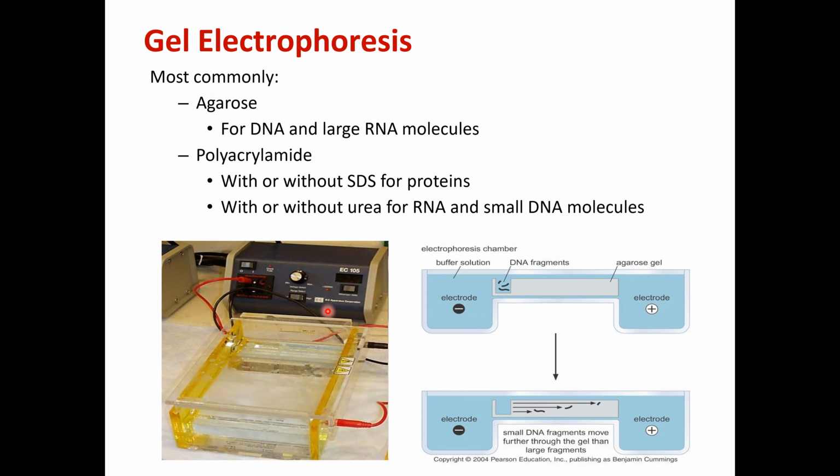This is a typical picture of a gel electrophoresis setup. We have the machine with the charges and the switch to turn it on and off. We have the positive and negative electrodes, then the DNA fragments and the agarose gel placed here. And then we have the buffer solution. We can put a lot of buffer here, but it should not go beyond the maximum label, so it does not overflow. And then we have some standard fragments.